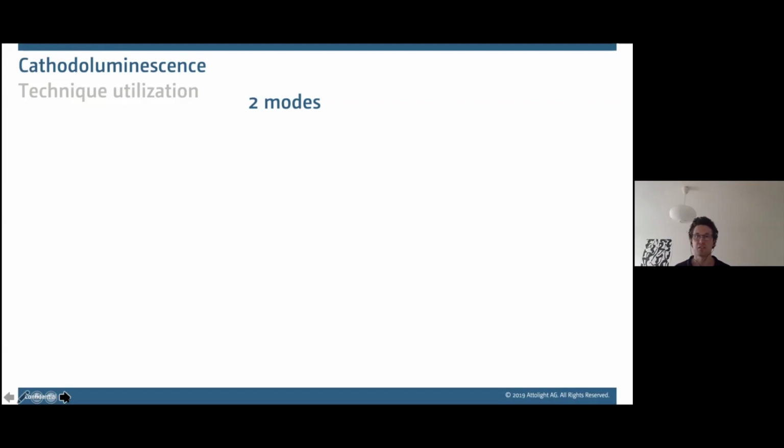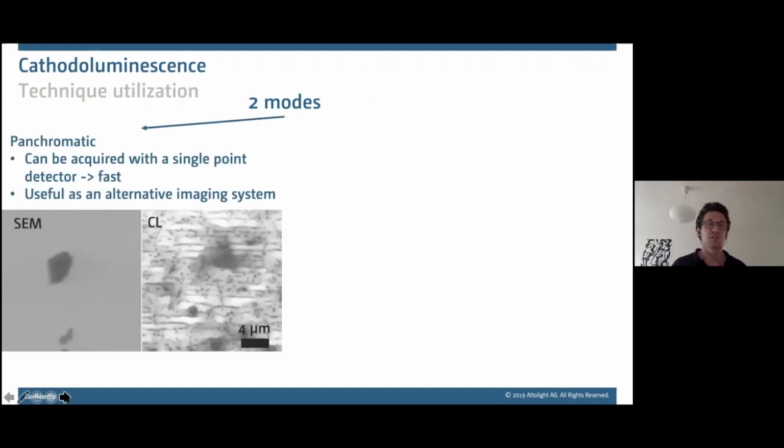So photoluminescence is sometimes not enough, and cathodoluminescence has a bunch of unique advantages that really make it quite compelling nowadays, as opposed to 20 years ago, because 20 years ago, perhaps many technologies would not really need cathodoluminescence per se. So historically, it's been used in two modes.